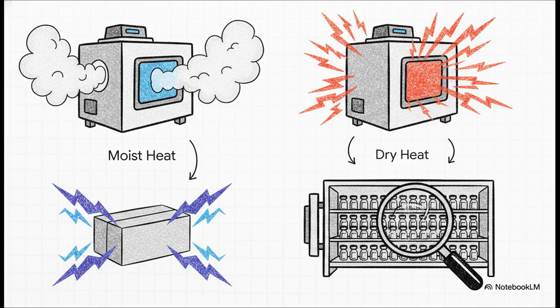Moist heat, usually steam, is preferred where compatible, requiring defined reference conditions and an F0 value. Dry heat is fantastic for heat-stable items and depyrogenation. Then we have radiation for suitable materials. But listen closely, a sterilization method is only as good as its validated real load pattern. Every single cycle must be validated for the exact load patterns you run in production and, of course, routinely monitored.